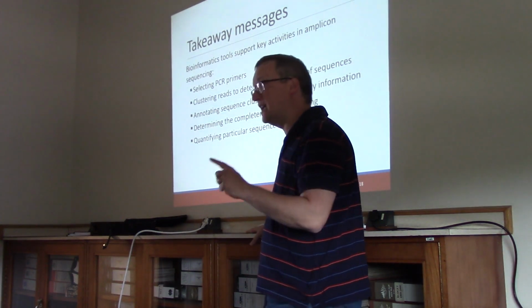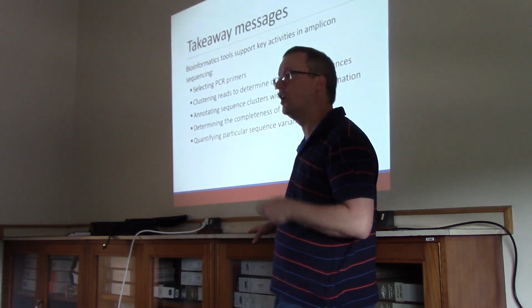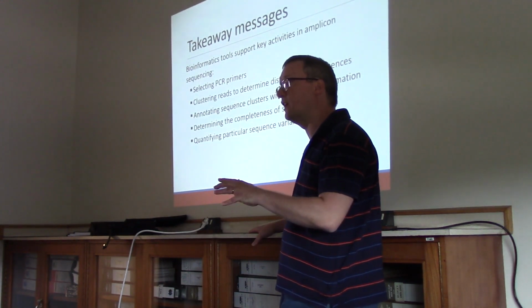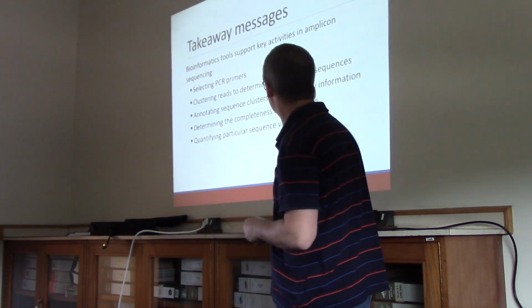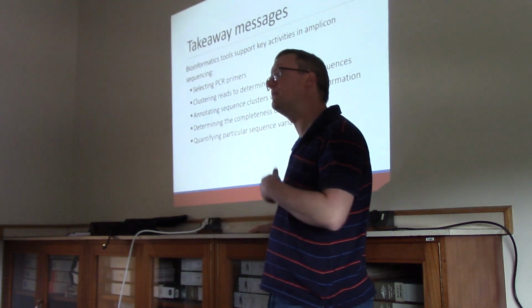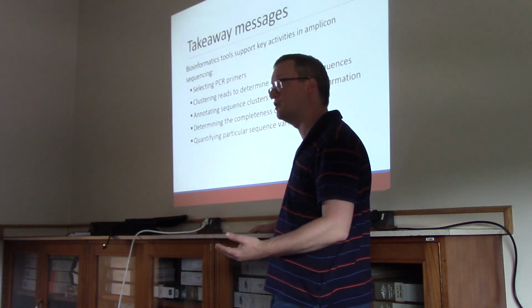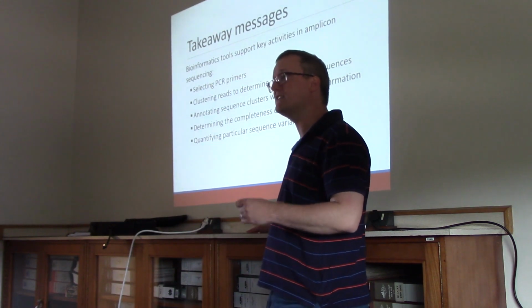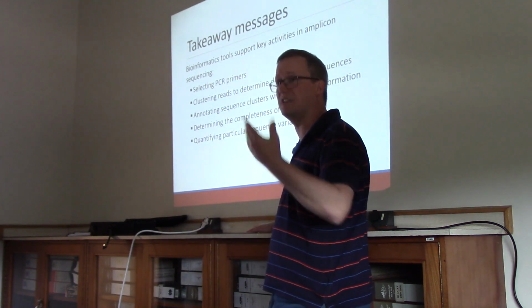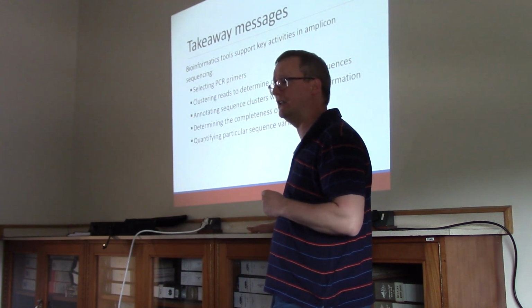We will then annotate these clusters of sequences with taxonomic information. Hopefully, the database we're working with has good information for the types of bacteria that interest us. Determining how completely your sequencing has sampled the organisms that are present in a mixture is very important. Being able to quantify remains a very difficult challenge, and having some notion of technical reproducibility is going to help us quite a lot in that case.